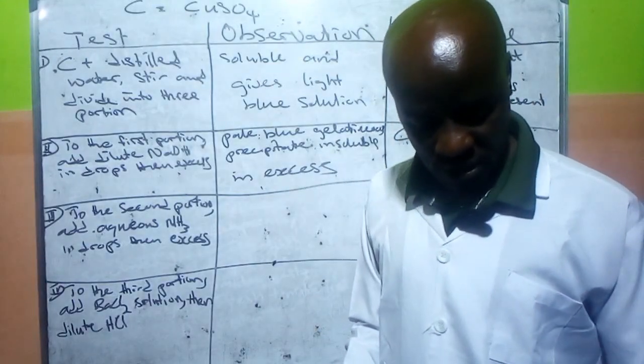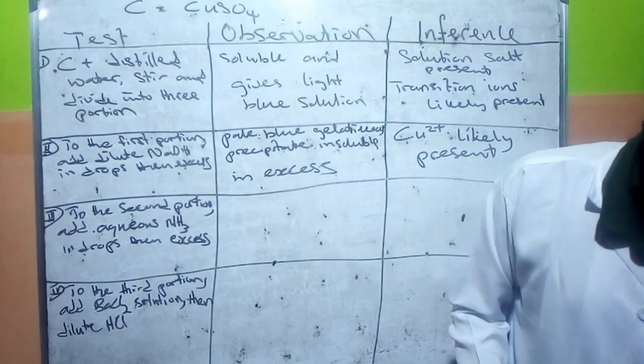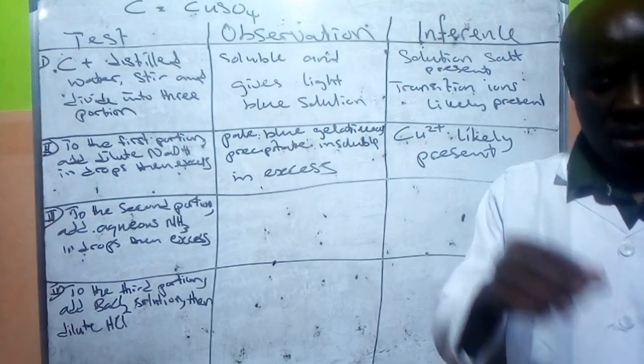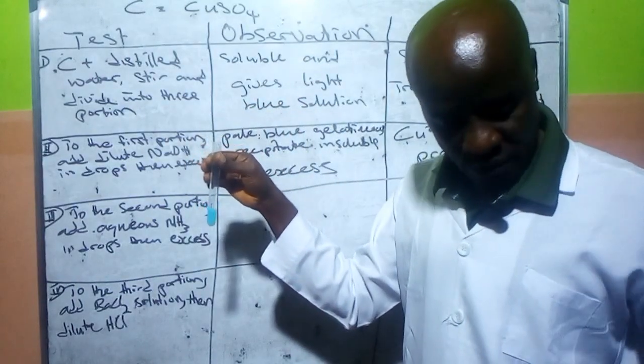If we add in excess now, like I said, it's always nice to reduce the volume actually. So let's add in excess in this small quantity that we have.